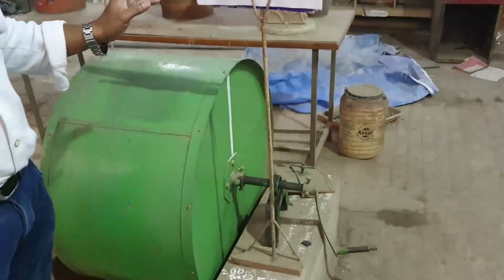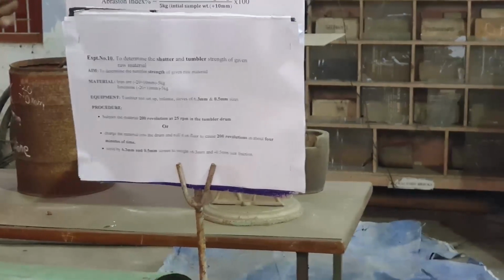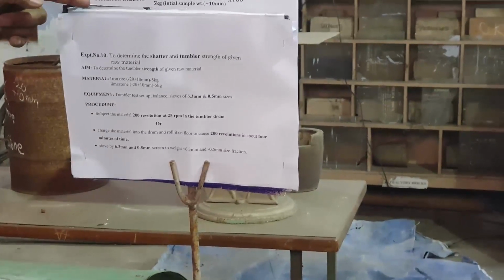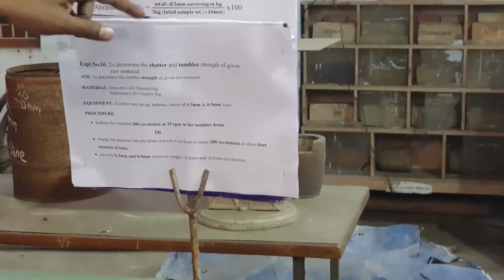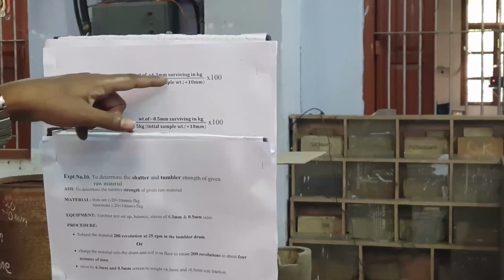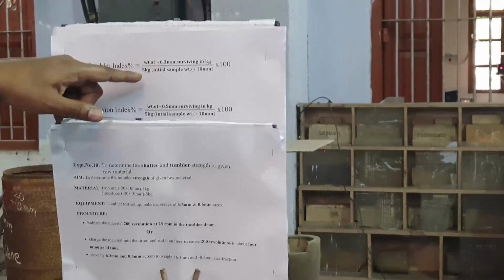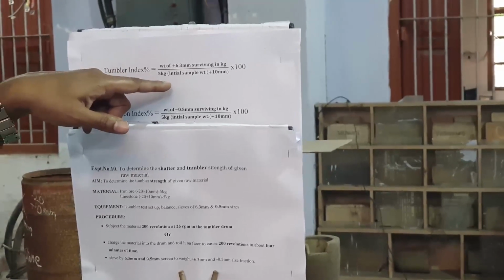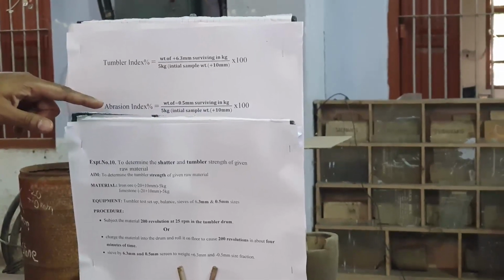And sieves, we need two sieves, one is 6.3 mm, the other is 0.5 mm. Why are these two sieves required? Because we have to calculate two things: the tumbler index and the abrasion index. For calculating the tumbler index, we need the percentage of material weight fraction retained on the 6.3 mm screen divided by the initial weight of the sample, that we are taking 5 kg, multiplied by 100, that will give the tumbler index.